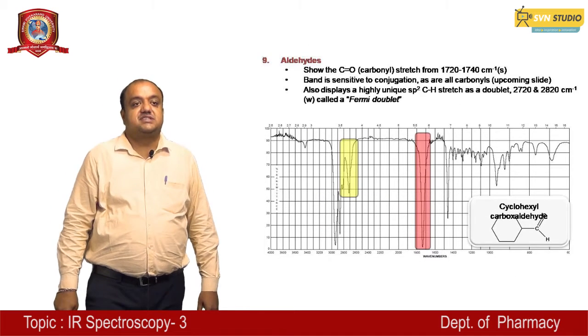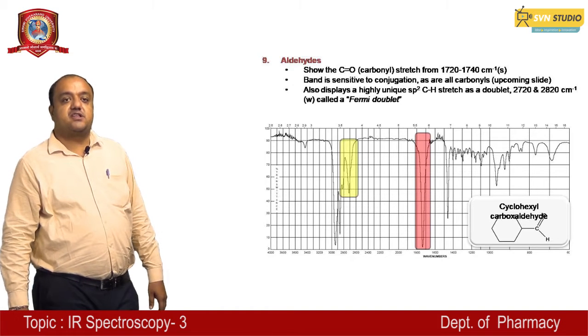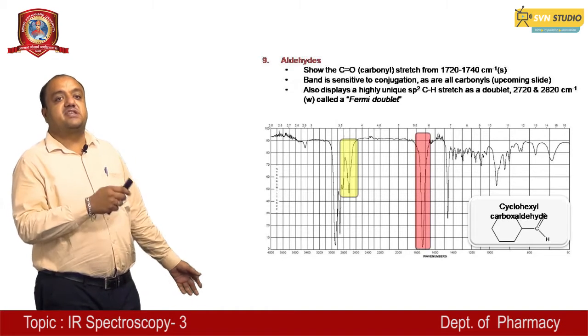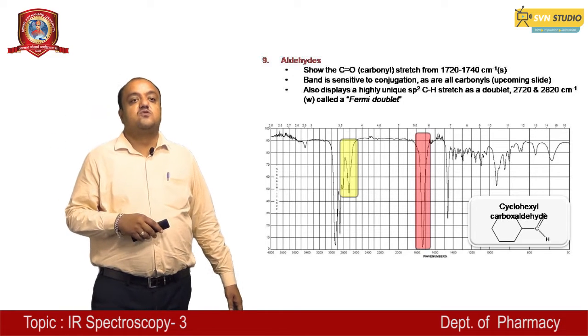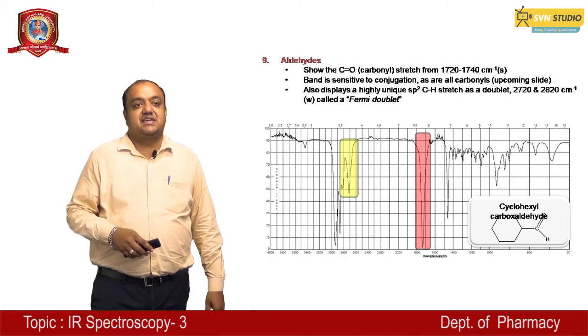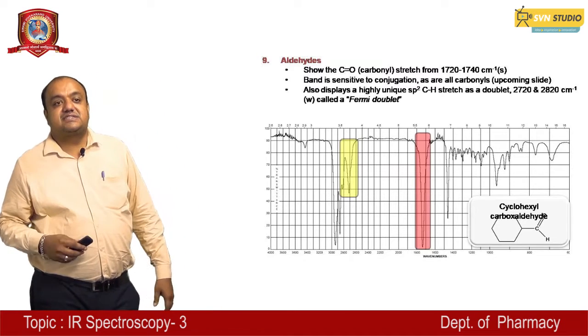Aldehyde shows the C=O carbonyl stretch from 1720 to 1740 centimeter inverse, and the band is sensitive to conjugation, which I will cover in an upcoming slide.